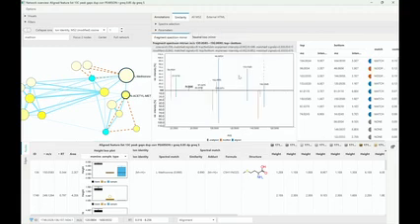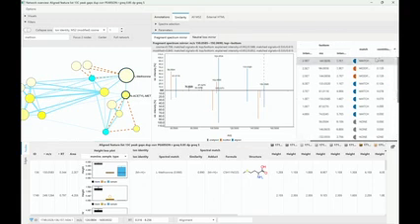And one more thing that's interesting, if you expand the table a little bit, on the right, there's also the contribution of each signal pair. If you have one signal pair that's massive, that's really just defining 99% of the intensity in your spectrum, and they match, they're also going to define, let's say, 90% of your similarity. So you're going to base your annotation just on one signal pair. This might be a water loss. There might be 2 spectra with a water loss, very intense signal, and then it's mostly what drives your annotation. That's why people always ask me how to verify that's actually my compound.